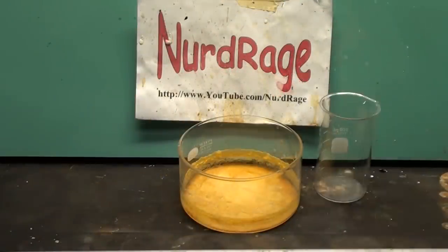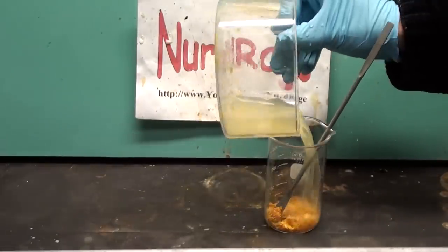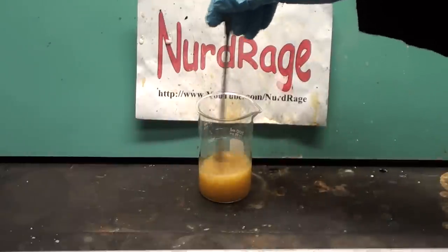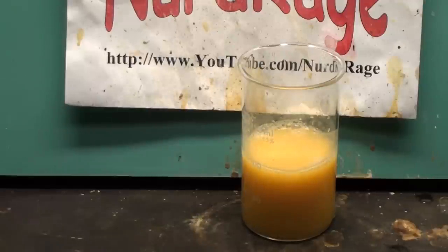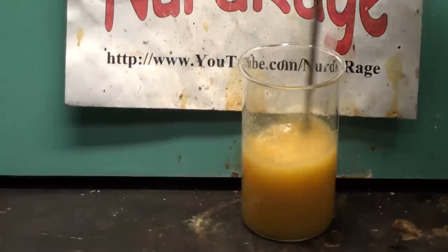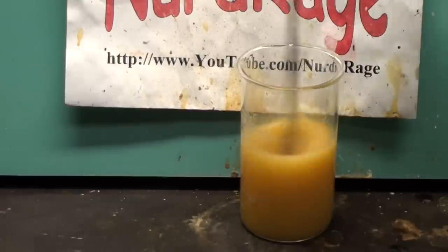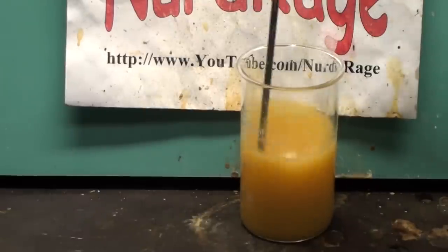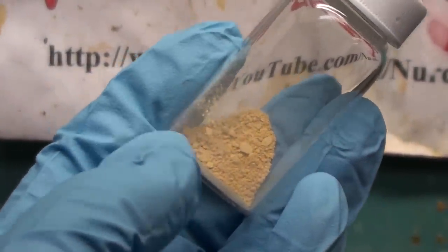Here we are a couple of days later. Break up the cake of luminol and transfer it into a beaker. Wash the dish with a bit of water, get out as much of the luminol as you can, and transfer the washings to the beaker. Stir up the mixture and break up the luminol flakes — there should be a fine suspension with no large pieces; add more water if the flakes are not breaking up. What we're doing is washing out any remaining salts from the luminol. Luminol has low solubility in water but the salt impurities have high solubility, giving us excellent separation of the luminol from the impurities. Simply vacuum filter the mixture and draw air through it to dry it. And there we have it — luminol made from domestically available chemicals.